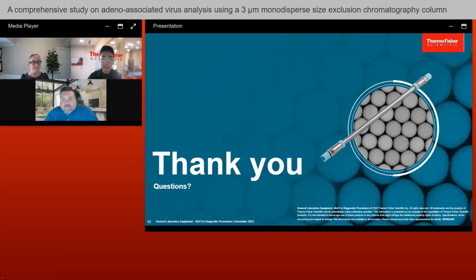So based on SEC only, it's going to be very challenging to separate empty and full. But if you couple with SEC-MALS, or SEC-MALS with RI detector, I think with certain calculation that can help, or with calibration curve as well, that can help you determine quantitation of empty versus full. But purely on SEC is going to be super challenging.